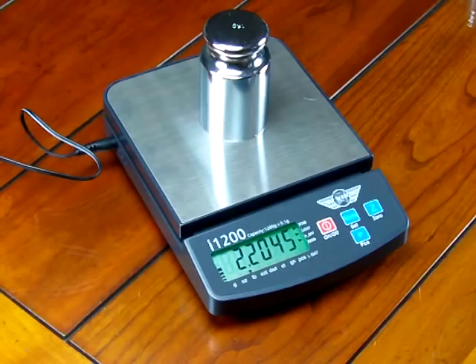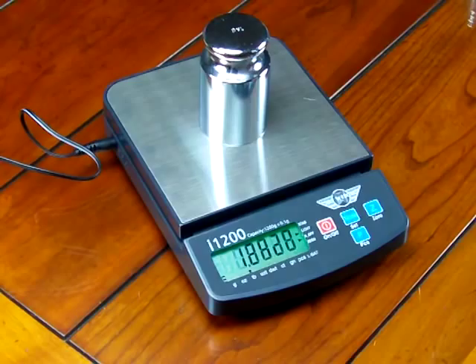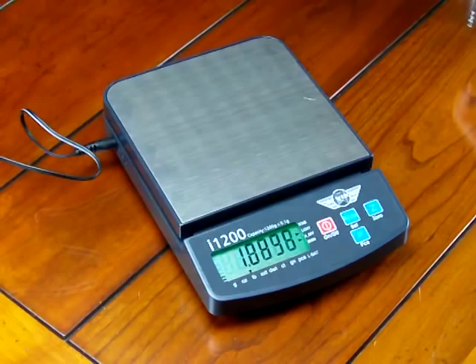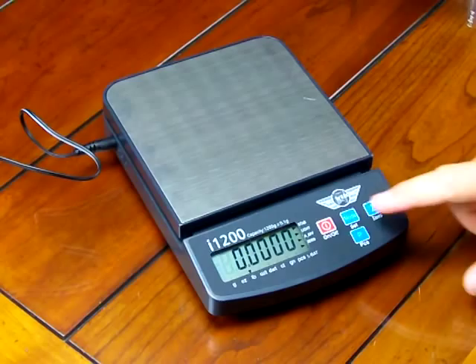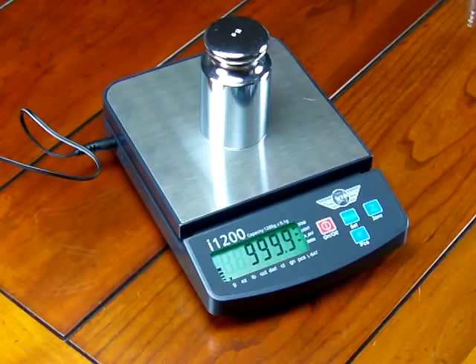A nice feature the MyWay has is if I left the scale on in pounds and then shut it off, when I turn the scale back on it will remember the last weigh mode I was in. So I shut it off in pounds — the scale powers up in pounds. It's a great feature. A lot of other brands, when you shut off the scale it goes back to factory default. Now if I want to set it back to grams, simply press the mode button and we're back into grams.